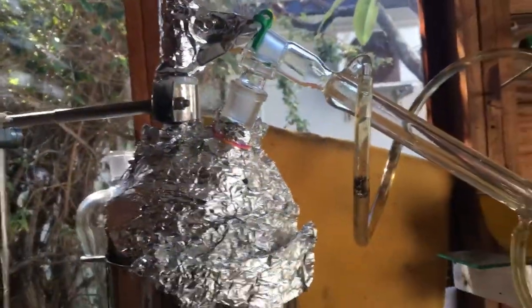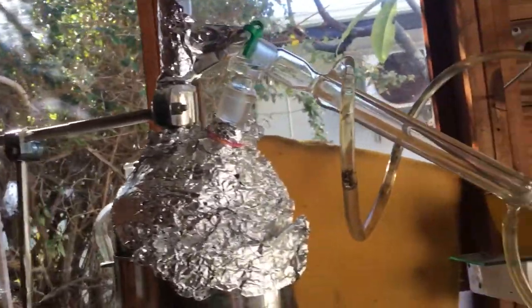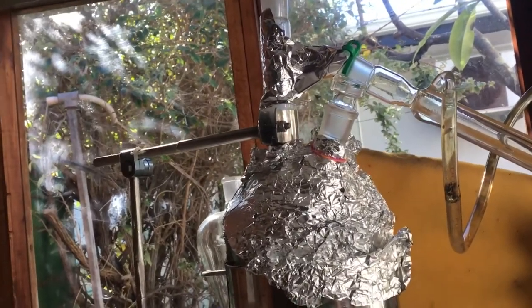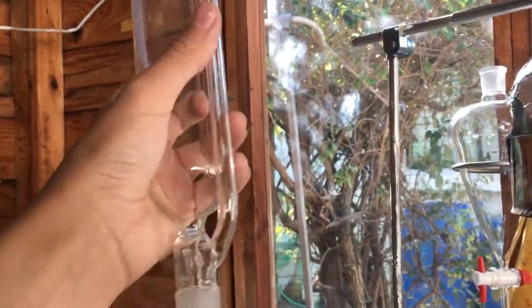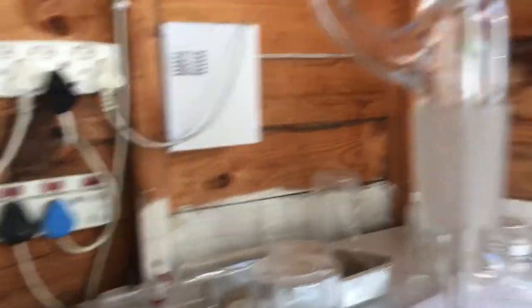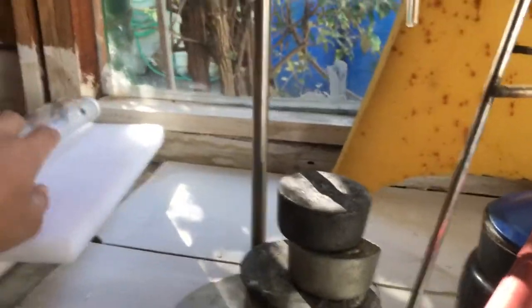I have done distillations already. I have made some fuming nitric acid, and I have made a drop of rosemary oil. I won't make a video on the rosemary oil, but I might make a video later — maybe roses or lavender oil. They sent me this pressure-equalizing funnel, but they never gave me the stopcock, so it's practically useless. But I found I can hook it up and fill it with plant material and actually steam-distill the oil off. So I found a use for that.